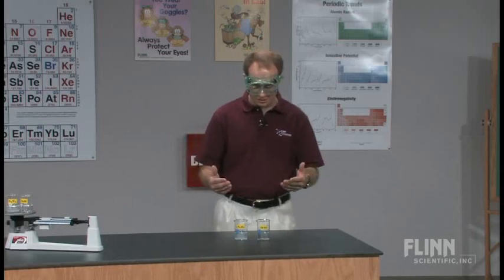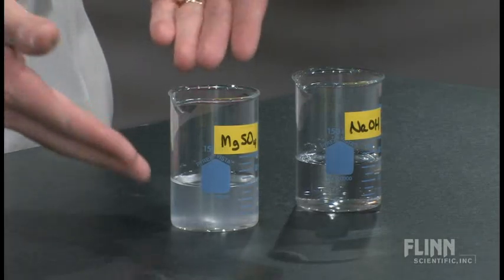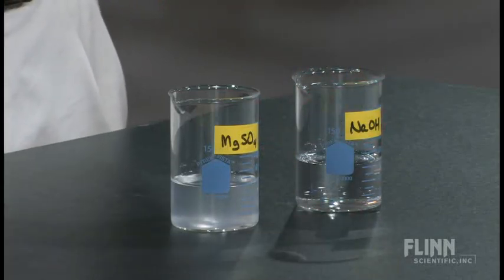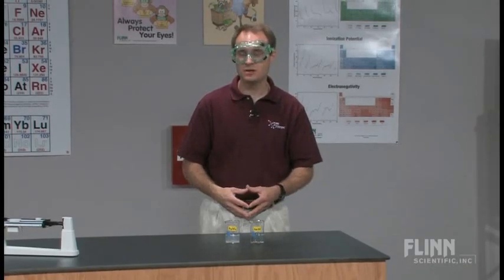What I have here would be a solution of magnesium sulfate, Epsom salt, and you could even show that being dissolved in water. Over here, I have sodium hydroxide solution. And again, you could show the solid sodium hydroxide being dissolved in water. What I'm going to do is mix the two together.